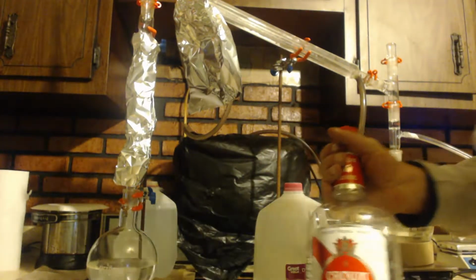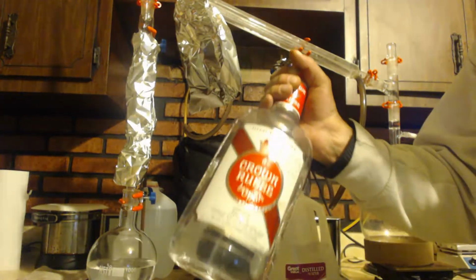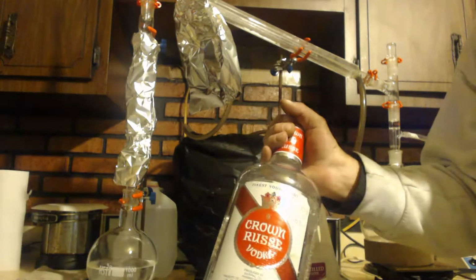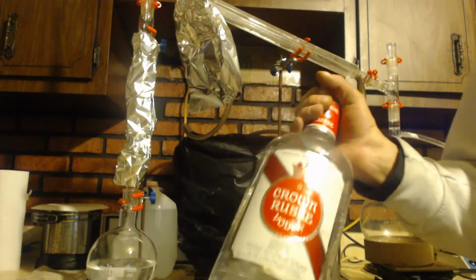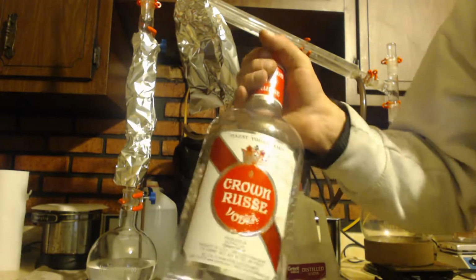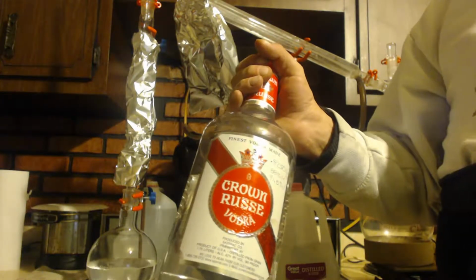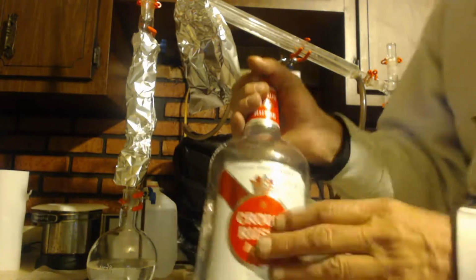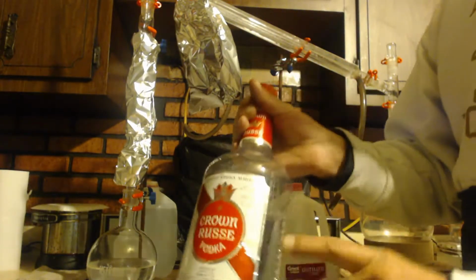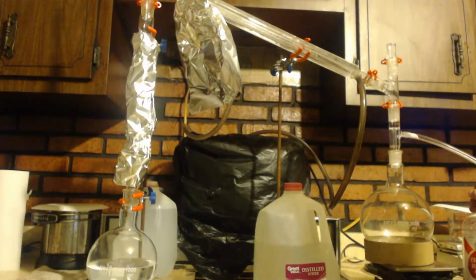Like, you can cut the azeotrope out by going below 70 torr, or 70 millimeters of mercury, whatever you want to call it. If you take the pressure down that low, you'll get rid of the azeotrope. You can distill it better. Potassium carbonate. There's a couple other ways, but anyways, I'll take this and I'll try a couple of different methods. This is the easiest way, or maybe not the easiest, but the one I know the best.